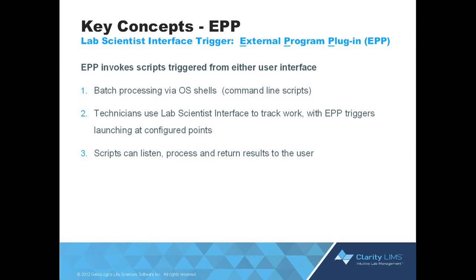So it's a very convenient mechanism for tying any custom business logic that you need to the LIMS and allowing your lab scientists to work in a seamless manner using just a single interface, without having to stop what they're doing and switch to a different interface to launch a script or program, etc.